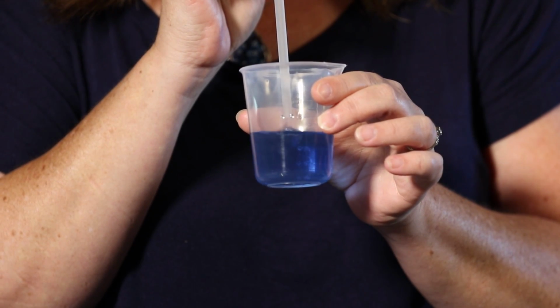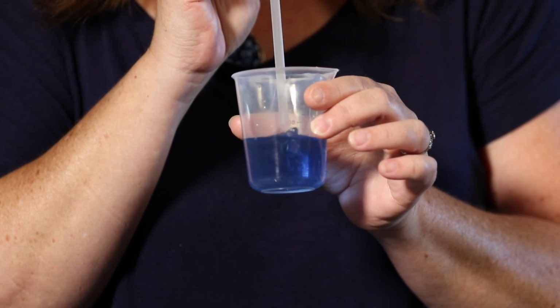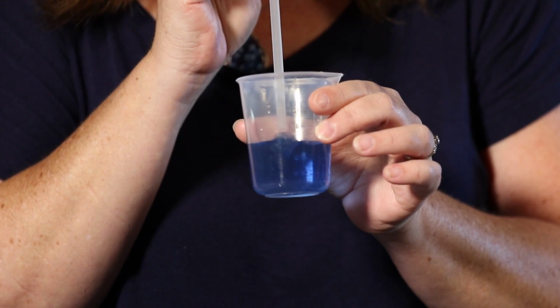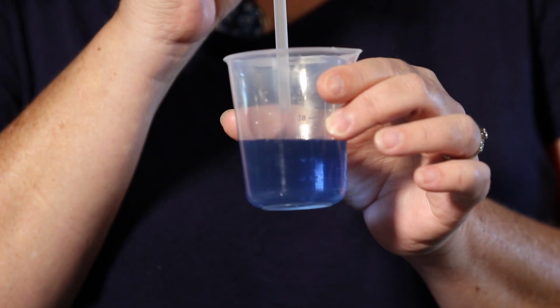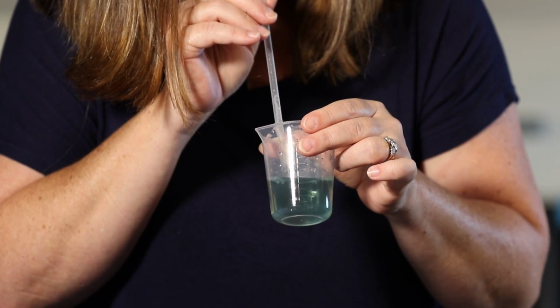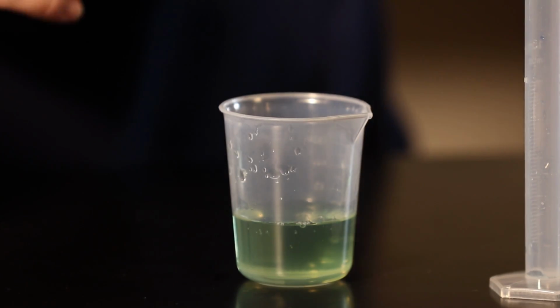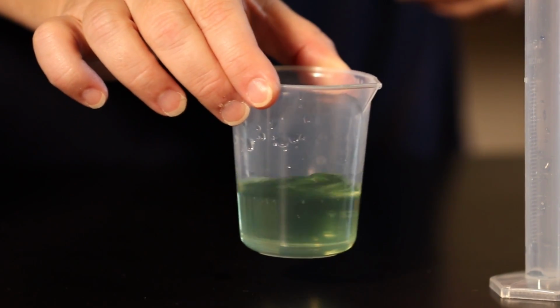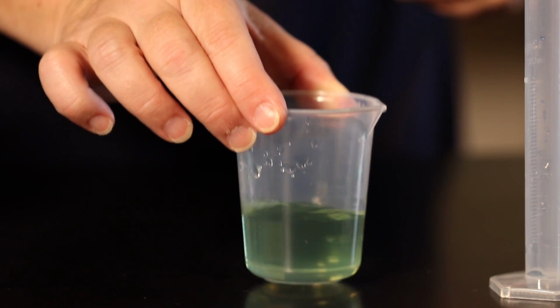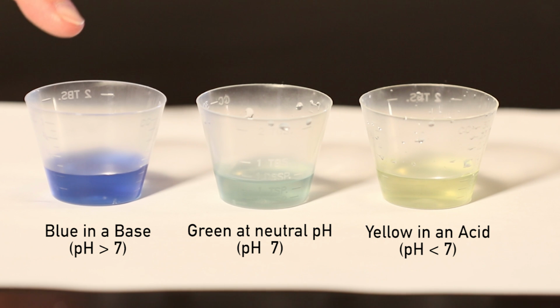After taking a deep breath, gently blow through the straw onto the surface of the bromothymol blue. Take care to avoid inhaling the bromothymol blue. When you see the surface of the bromothymol blue turn green, pull out the straw. Swirl the beaker to distribute the carbon dioxide. Once your solution is green, stop adding carbon dioxide. If you add too much, getting a positive result may take longer than the scheduled incubation time.